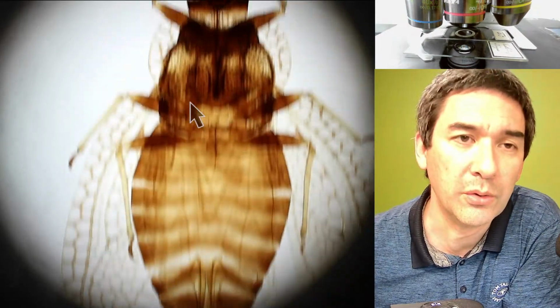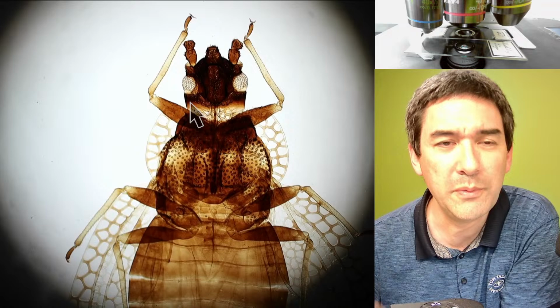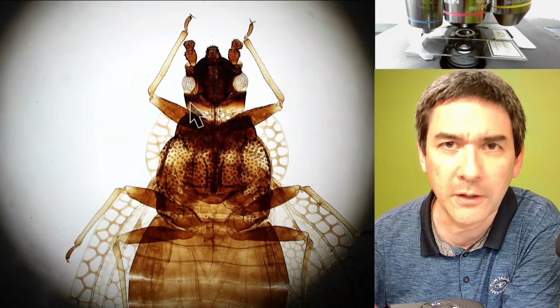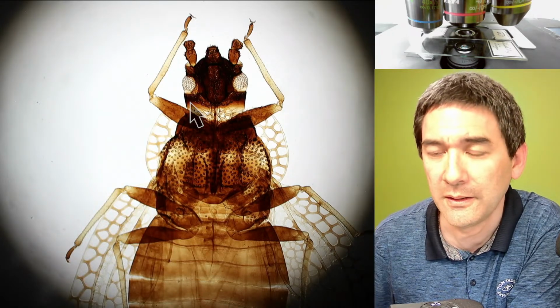They last long. If you do this properly, they can last a very long time. This does not seem to be a cross section, but it seems to be more like a whole mount. But just for clarification, if you prepare them properly, they're properly dehydrated, properly mounted, they last indefinitely.